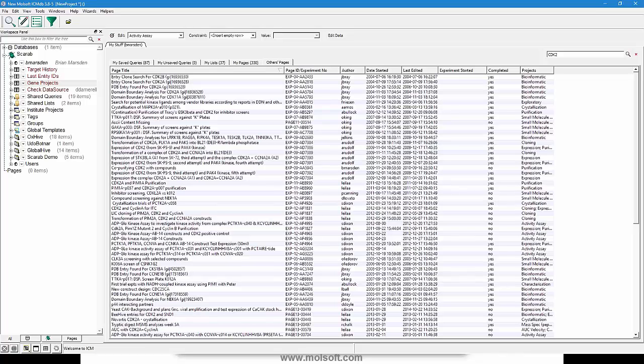It isn't as fully featured as a Google search as we would like, although that is one of the next things that we want to do, and we're actively thinking about ways in which we can make it easier to not only do Google-like searches in the context of these pages, but also in the context of the structured stuff, which I'll show you in a minute.